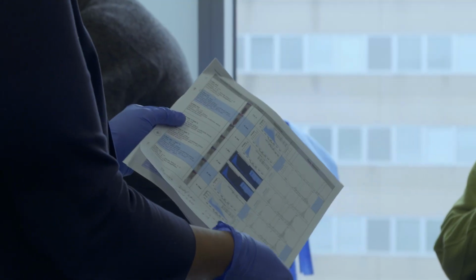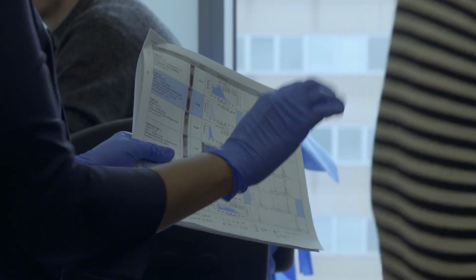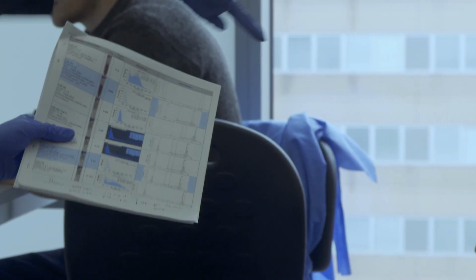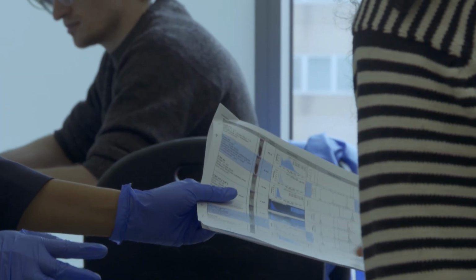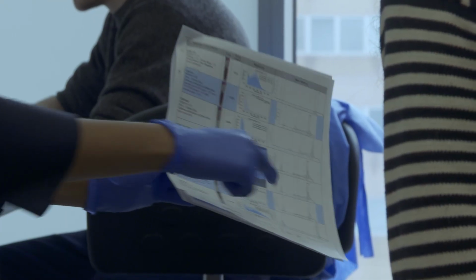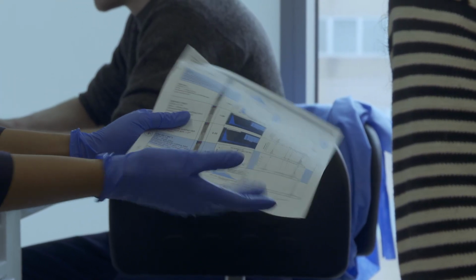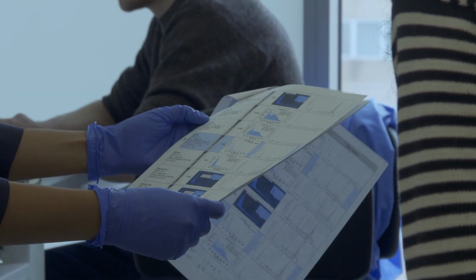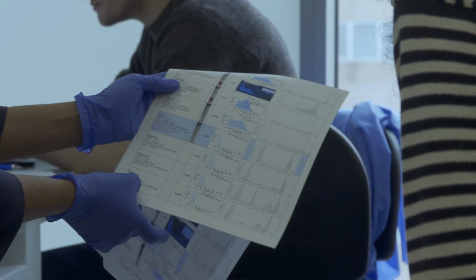Every sample has gDNA, and these high molecular weight peaks are mostly gDNA. Okay. I don't think those are the polynucleosome, then it should not be this much. Hard to say. What about this one? It does not have anything in the correct region. Oh, okay. So it's probably a sample completely lost. Okay. For the plasma, we are taking plasma C.